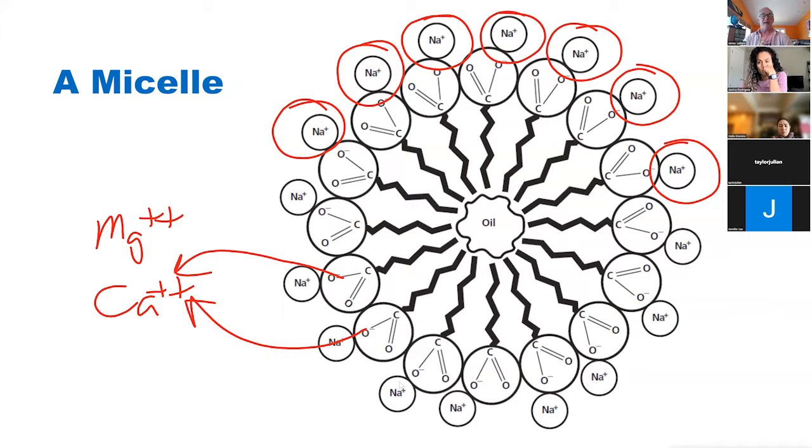And what happens a lot of time is it will precipitate, because you'll have this long chain that now is being forced to go into the water. It doesn't like being in the water. It doesn't make enough interactions with the water. So what it typically will do is just fold up on itself, and it'll just crash out of solution.